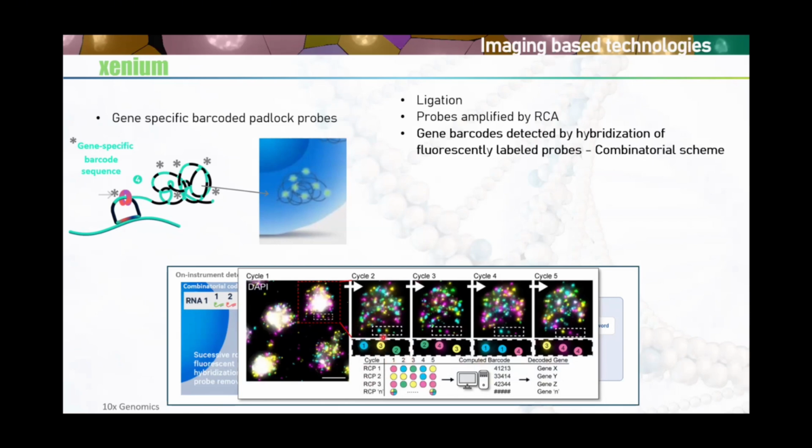If you look, for example, at these spots here, you see that in the first cycle this position is pink. The next one is blue. And in the next one is green again. And then after this, the color of the spots is recognized over the different cycles. This is compared with the barcodes for each of the genes, and then we can get the identity of the genes.